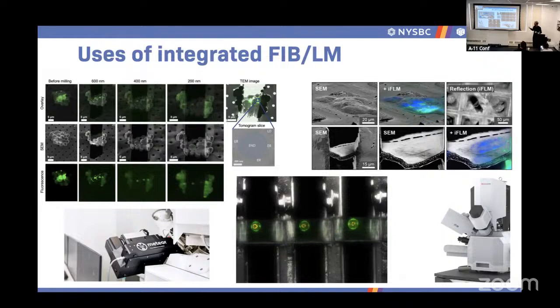It's kind of interesting that the latest and best on the market is as good as my first prototype, which was like eight years ago. I don't understand that. But regardless, what you end up with is essentially a decent way of mapping your sample. You don't need to transfer, they work fine. It's just as it should be, pretty much as advertised. Both options really do that. Some software is better than others, but I'm not here to judge.